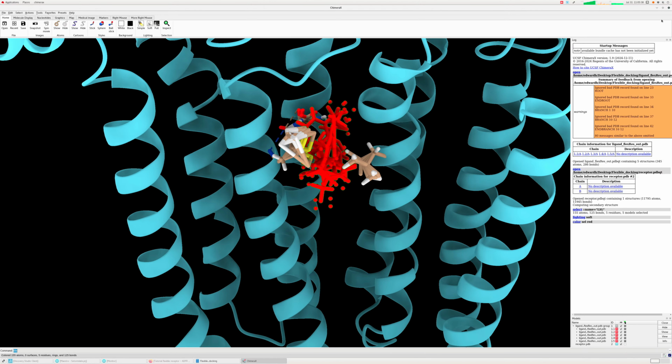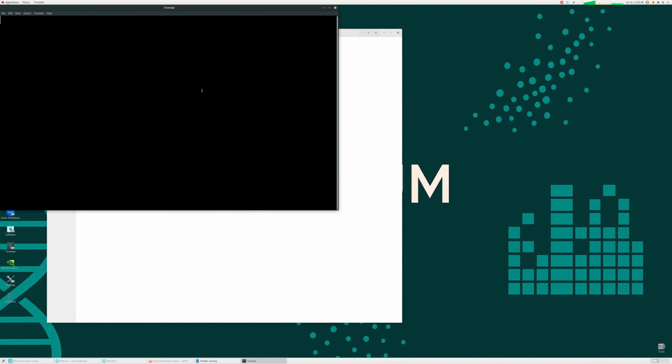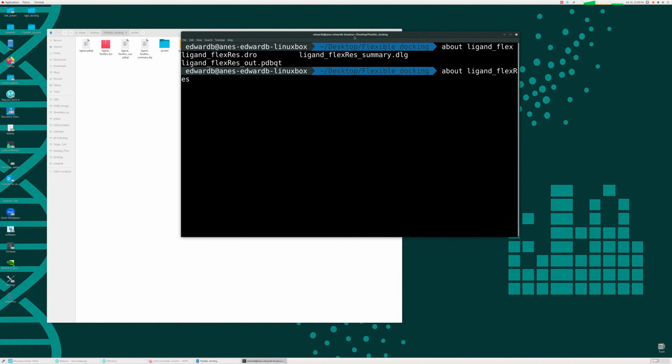Rigid docking is mostly used for virtual screening, but flexible docking is the actual docking, if you want to compare it with X-ray crystallography structures, and then you can define your flexible residues to identify the binding poses. And yeah, that's it.